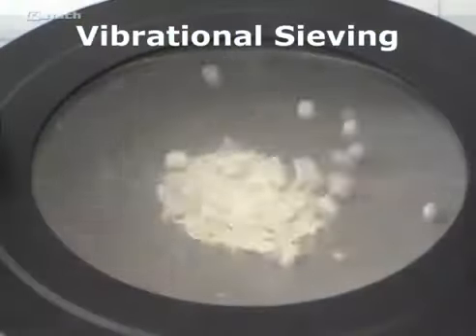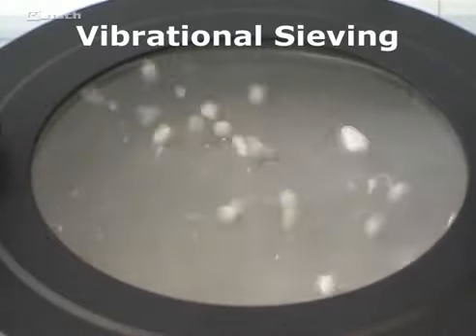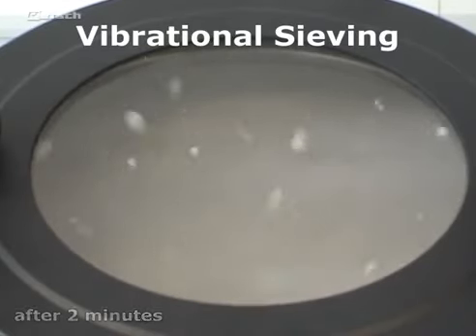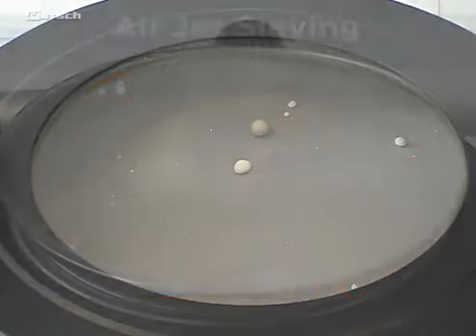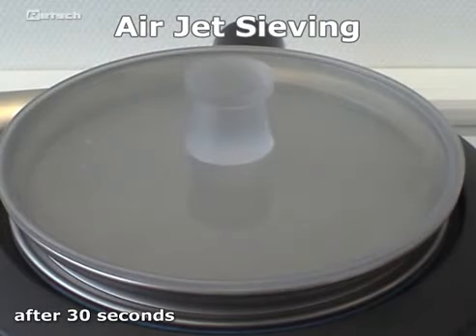Vibrational sieving of sensitive or very light sample materials with a tendency to agglomerate, which primarily applies to particles smaller than 200 microns, is very difficult. It is definitely problematic for particle sizes below 63 microns. In this size range, airjet sieving is the perfect solution.